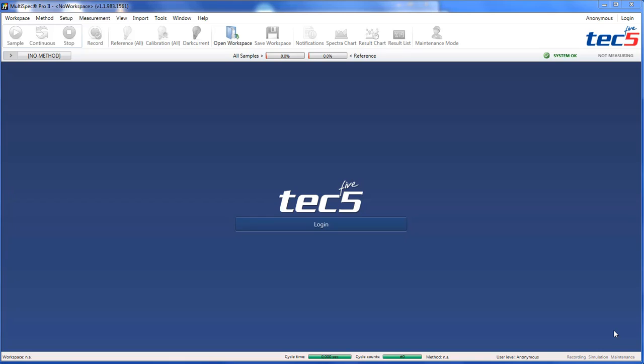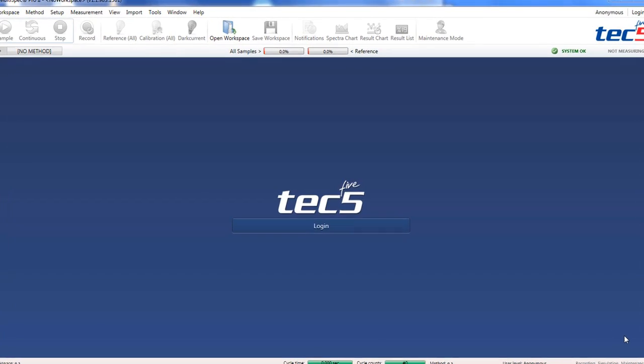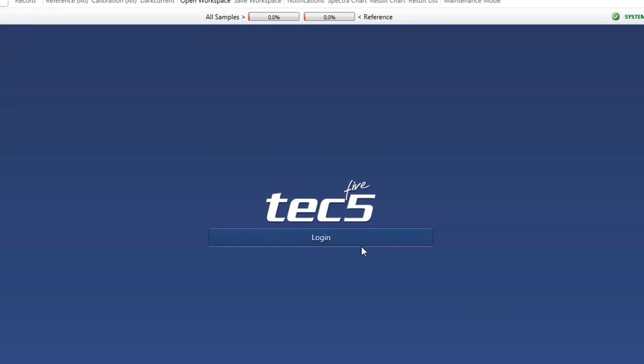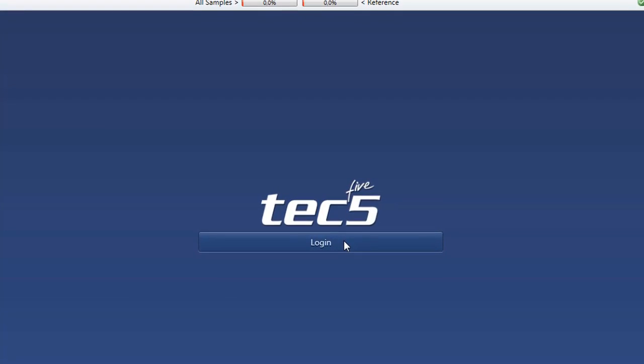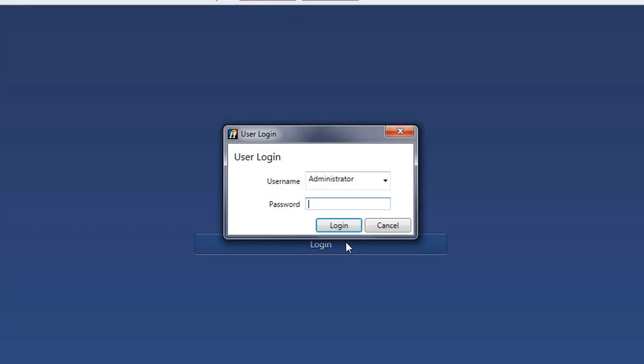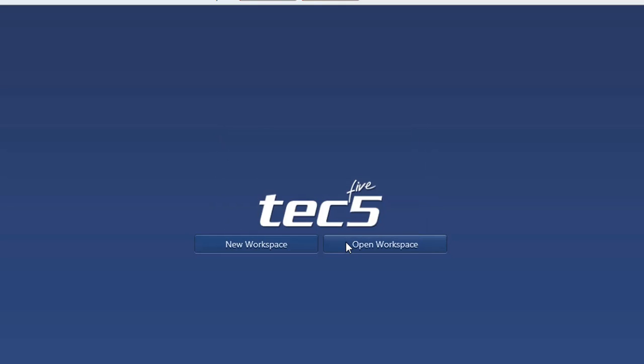In all Multispec Pro 2 versions, ProSys and Raman and for options User Control Module, you have to log in before you start with the configuration. The password can be found in the manual.